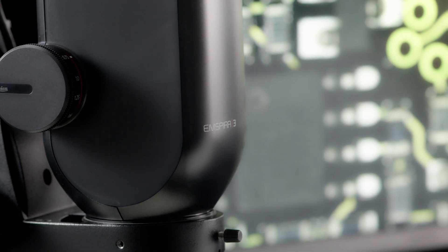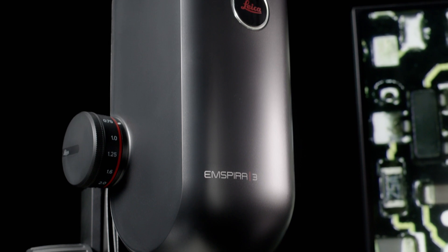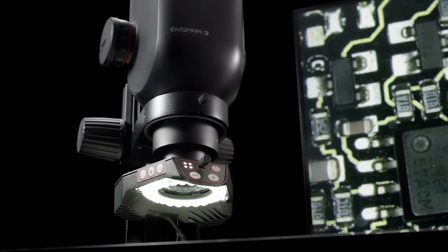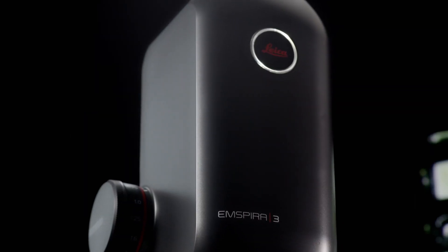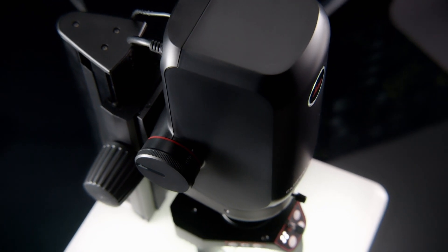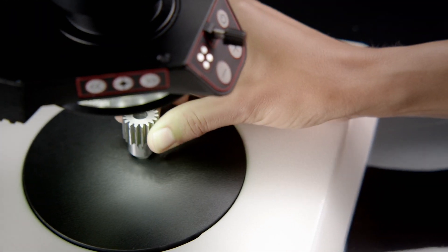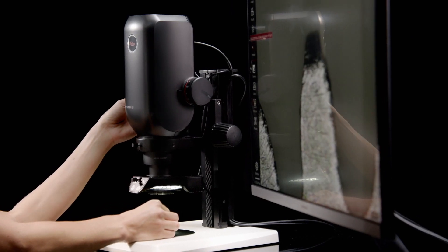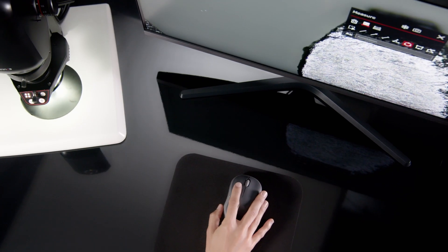Introducing the Emspira 3 Digital Microscope. Designed to optimize your inspection efficiency with one integrated solution for comparison, measurement and one-click data sharing. It empowers you to streamline inspection processes, cover inspection needs flexibly and work with confidence.